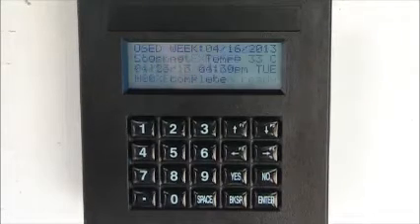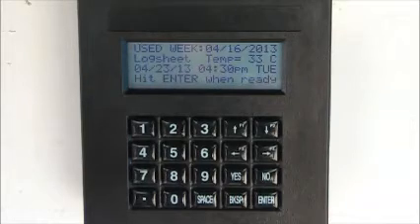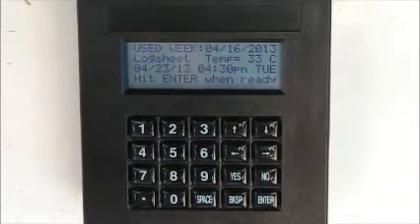The keypad will then confirm the used week date, which should be the date on which the week 3 samples were installed, and today's date. Find the temperature listed on the screen and write it down in the temperature section on the week 3 log sheet.